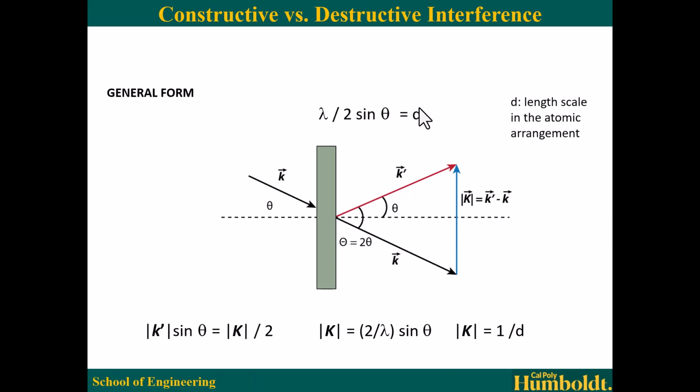And this is important because when we get to amorphous structures or semicrystalline structures, those do not have the fully crystalline behavior that we observe in metals. So you're going to see a difference in the diffraction pattern that we observe. You're going to see peaks getting wider, the width of those peaks increasing. And the width is because we're getting diffraction from other distances. So it's not this preserved distance that occurs throughout your material.